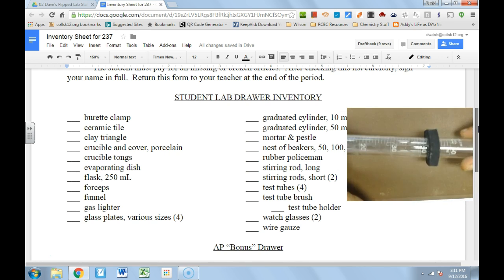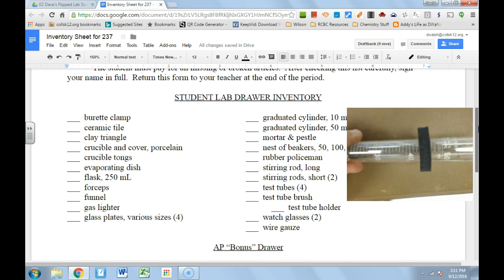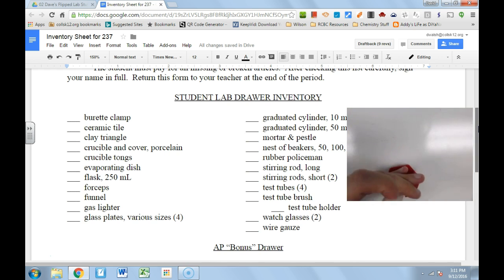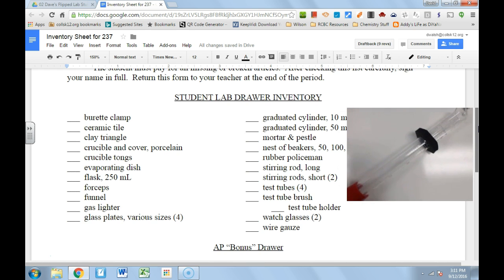One thing people get confused by is the little round collar at the base of the graduated cylinder. When you're using it and you knock it over, that collar keeps it from breaking, because all this glassware is expensive. So when you drop it, the collar prevents the glassware from breaking — try to keep that collar on it.